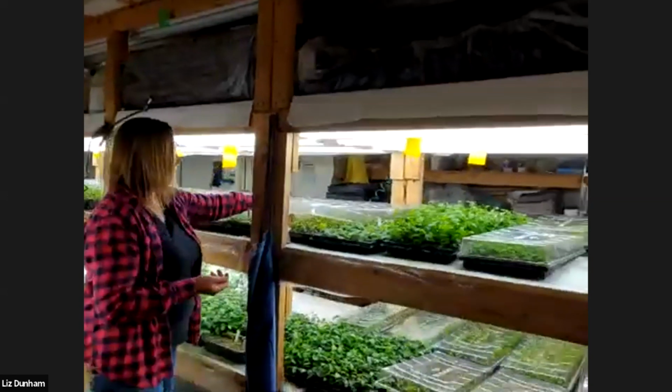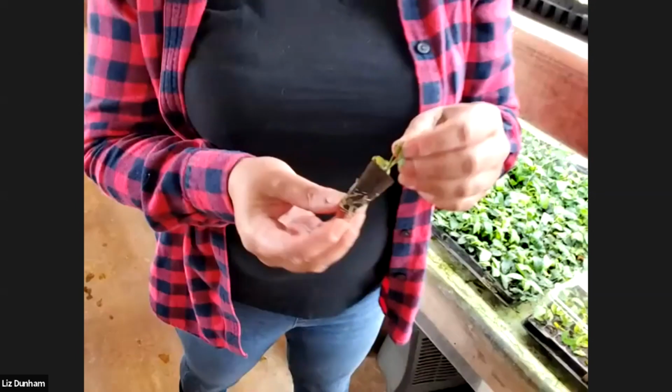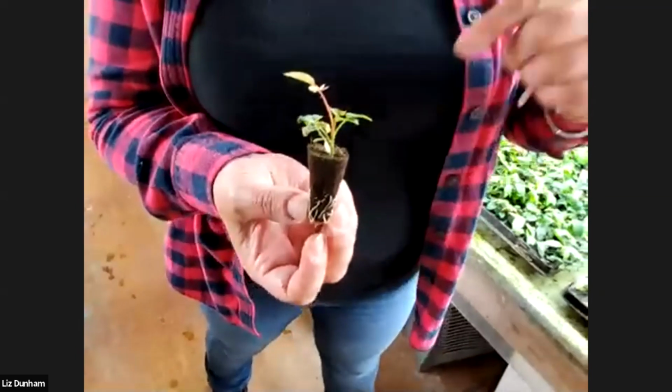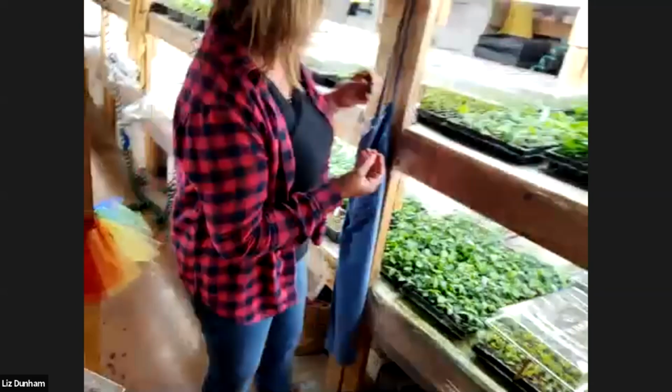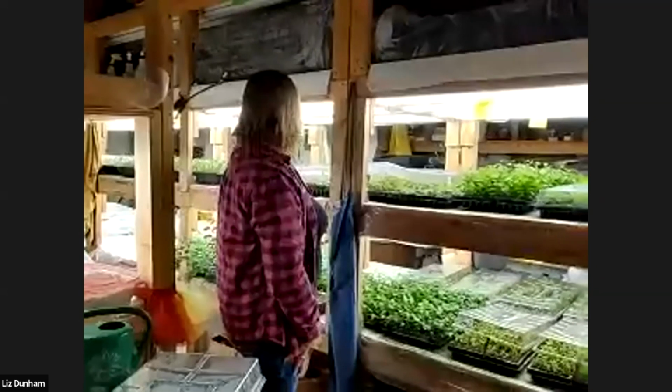Here's another rose, completely acclimated. This is a new rose for Teslar. We sent these to Canada. The same ones that you saw in culture, that's this rose right here. So you can see the process as we scale things up. I think that's probably all I need to show you in here. We're just going to take you out to the greenhouse.